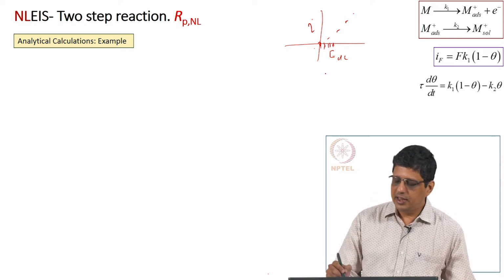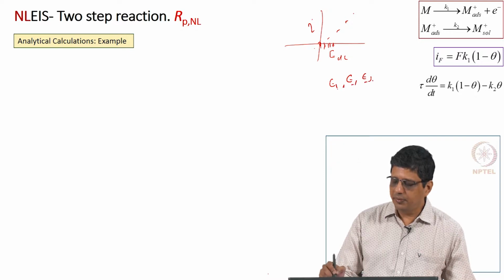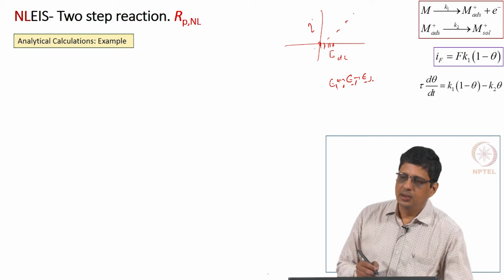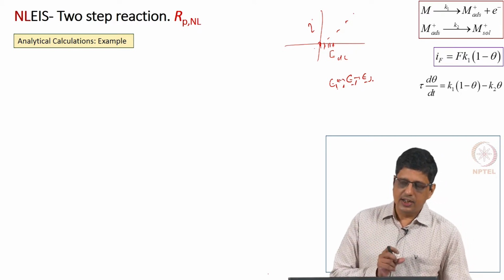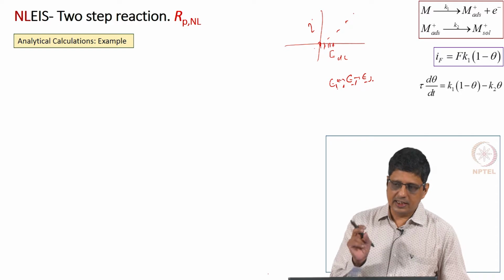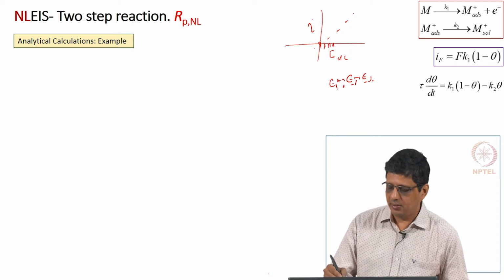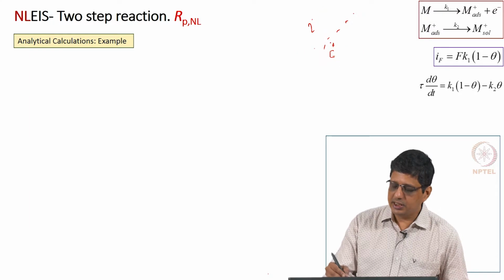Now, if I take E1, E2, E3 and make the intervals very, very small, I get a little more accuracy, but again if I make it extremely small, I will have round off errors. So, numerical derivative is something we should avoid if you can. If it is possible to get an analytical expression, it is better to use it.